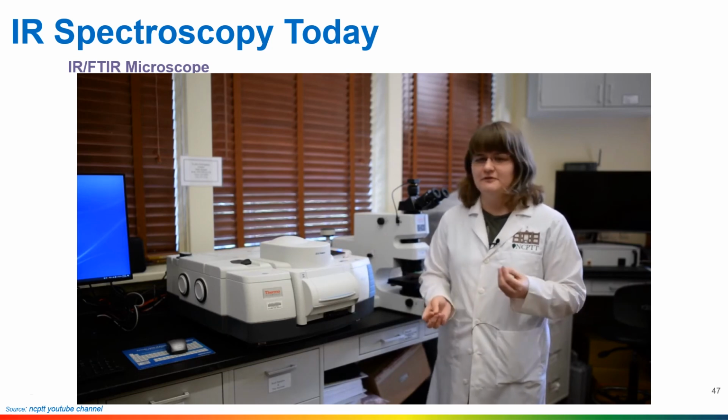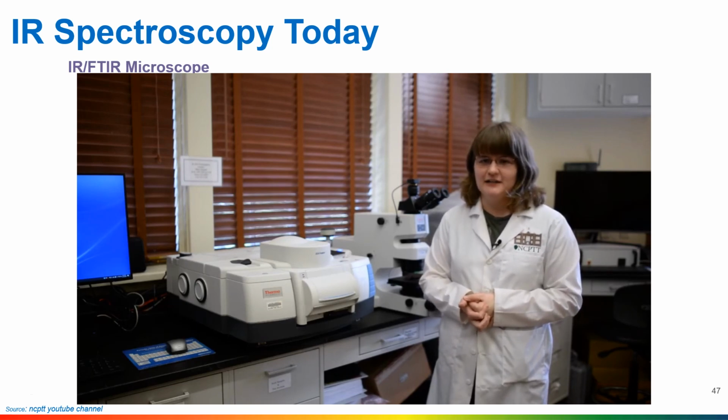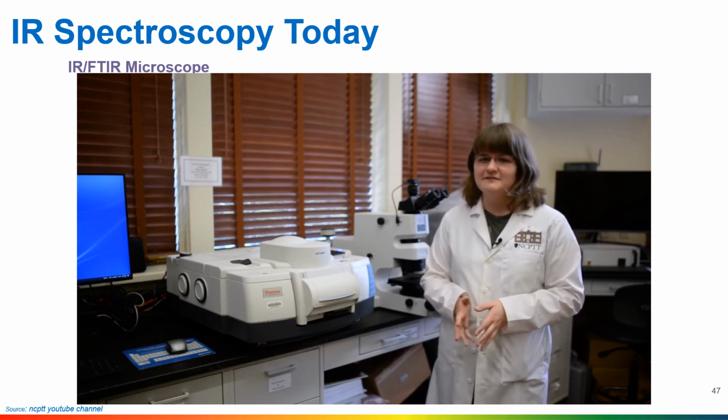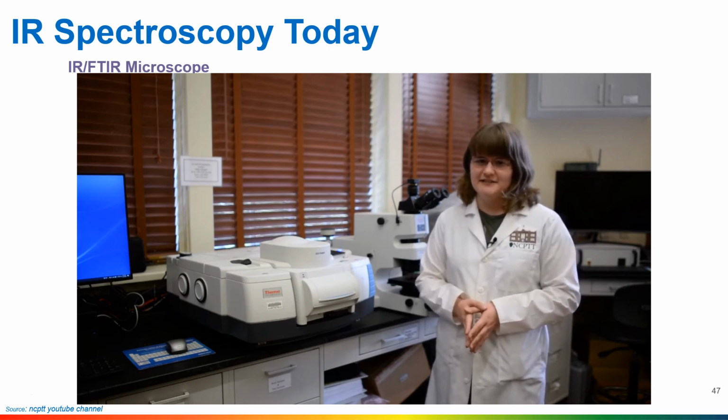So that spectrum reveals useful things, again, like the functional groups and other information we can use in identifying the compound. So this test is relatively simple to perform because it doesn't require a whole lot of sample prep, and it's fairly consistent in the results that it gives us.